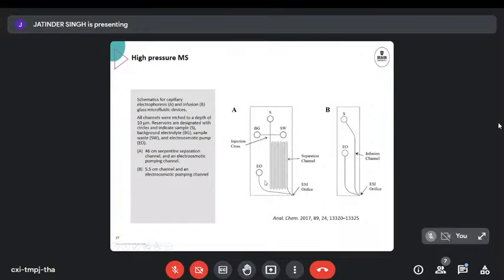Here we've got another fluidic inlet that will allow us to get a sheath flow to support, to bulk up the flow, to have enough mass to enter into the mass spectrometer. And in this case, it's done by electroosmotic pumping. So we've got a very, very long separation channel here, 46 centimeters. And then boost the flow into the spray interface using an electroosmotic pumping channel here as well, because otherwise the rate that the liquid came out of the separation wasn't enough to sustain a stable electrospray.